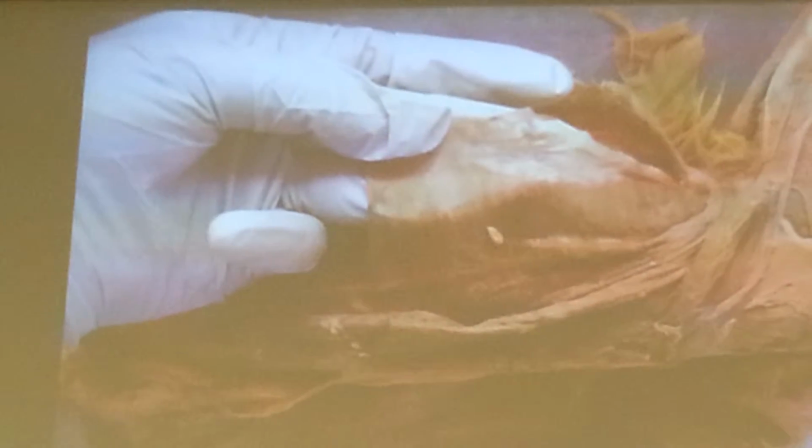You see how lateral it is in the cat? Is this one. And it has one aponeurosis by itself too. This is the muscle, this is its aponeurosis, right? And it continues all the way here. And if you can see the borders from far, that's the continuation. This is the internal, right? Clear, everybody?